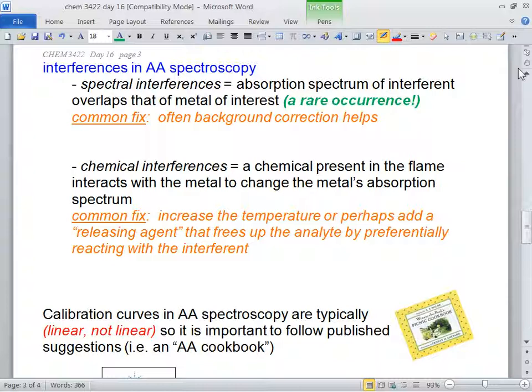Interferences. Spectral interferences. This is rare. You're studying for calcium. You know that absorbs at 550.25 nanometers. You have the calcium lamp put in there. But there's something else in the sample that also absorbs at that line. So there's two metals that have the exact same absorbance. It's rare though. The fix is this background correction button that you can push. That doesn't happen very often.